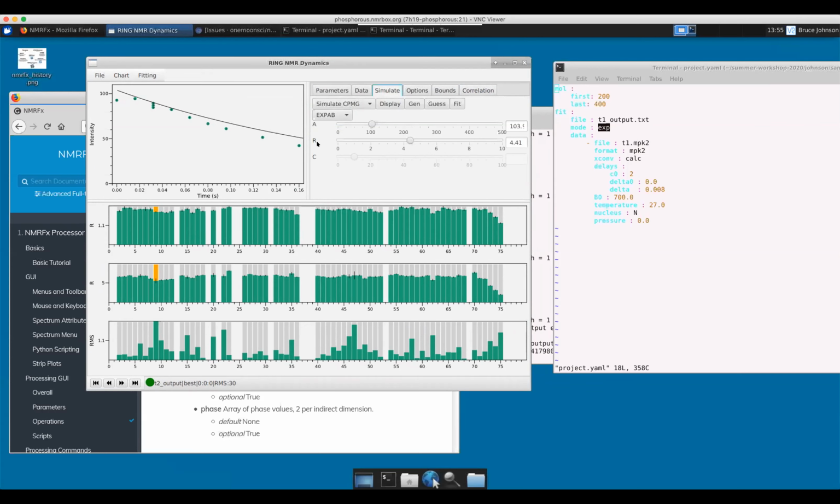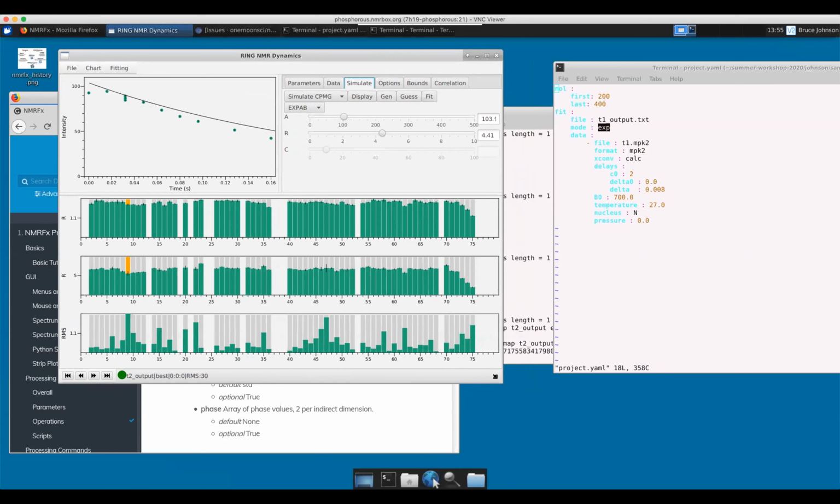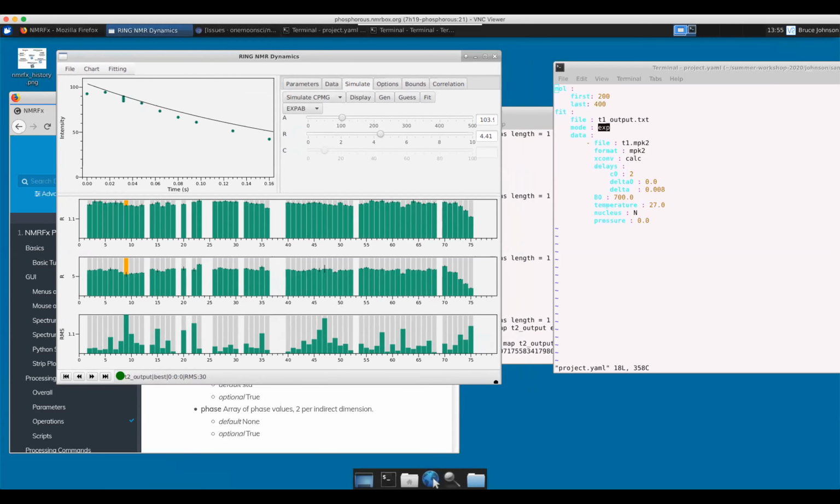Okay. But there's no reason we couldn't put in a multi-exponential one to let you choose from. It's in mind to basically let you define an equation, but that's going to be a bit more work. Yeah, I was about to come to the next question. Yeah, I know we know how to do it in a sense in the software, but it's a bit of work to get there.